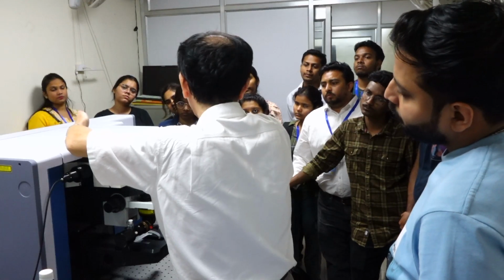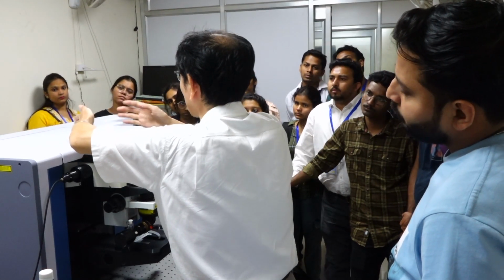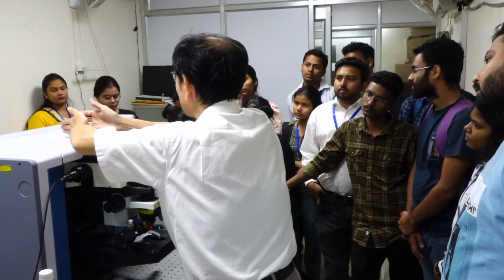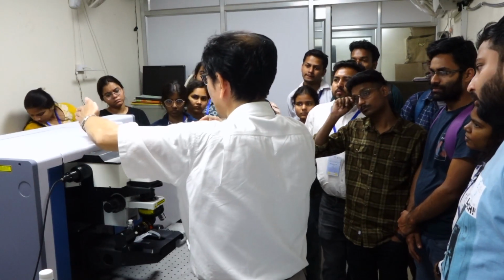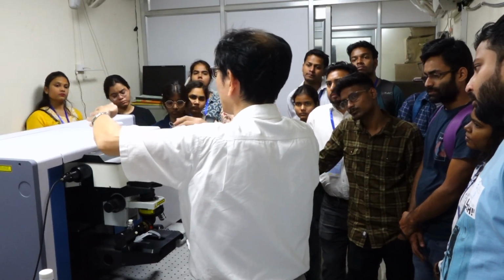But for the Raman signals, it is a mirror, because it is above the cut-off wavelength. So the Raman signal is reflected and goes into the monochromator. So this is the optical element that separates 633 and Raman signals.